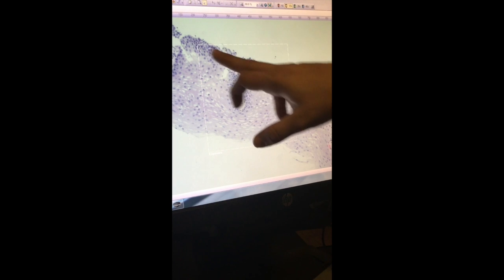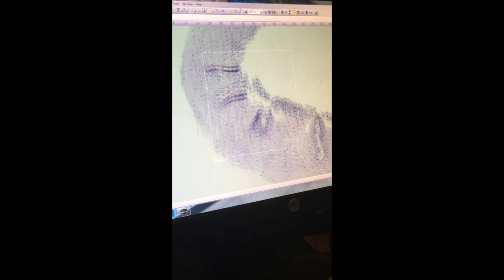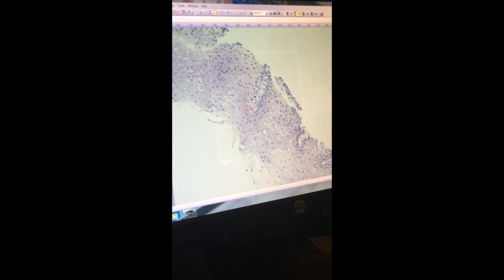Maybe. There it is. That's blank. Maybe not. There it is. I see lines in it. You do. So those are cells. So that's a basal layer, that top layer here. This is what's called a papillae. You'll see a lot of pink in the papillae, but those are red blood cells. What's the bottom bit called? That is part of the basal layer. Just a little bit different of an area. So those are red blood cells in the papillae, right there.